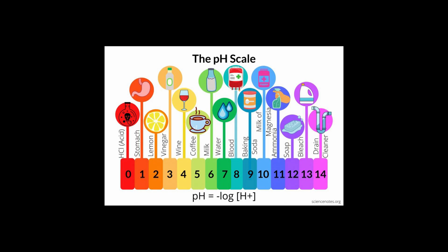Then I wanted to produce the degradation with common household items, just in case you want to reproduce it, to make it easy for you. Looking at the different products that we can use, I decided to go for vinegar and lemon juice. So I bought a lot of lemons and put the glass in lemon juice for a while.